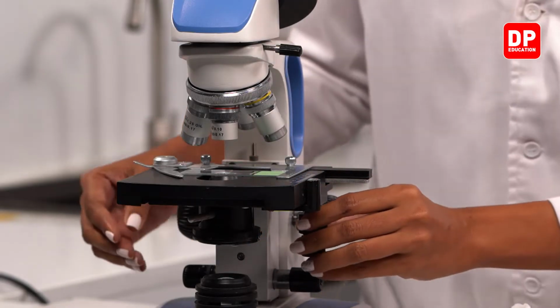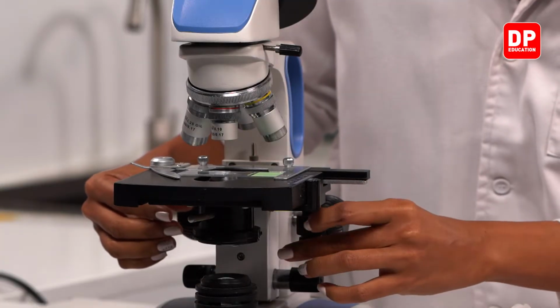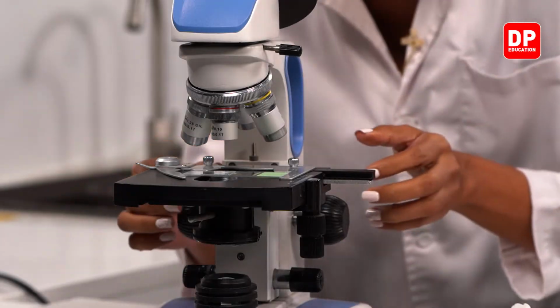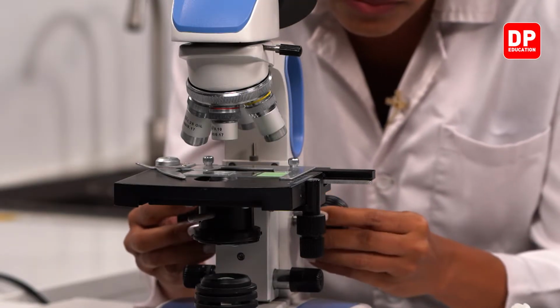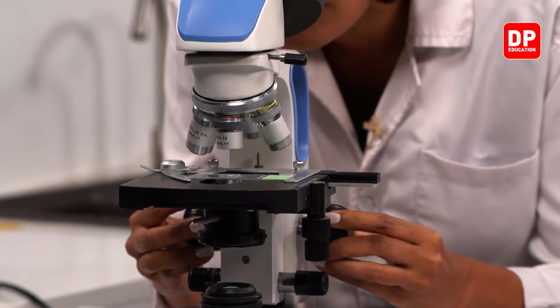And now I am going to adjust it by looking at this one. Observe carefully, children. You all can see a very clear image of the cells.